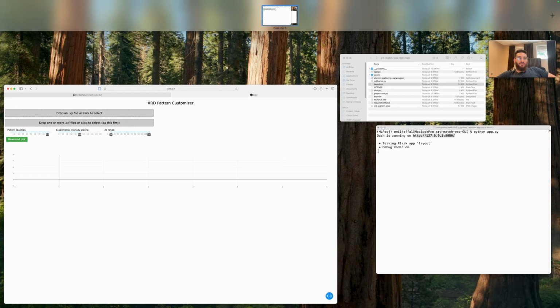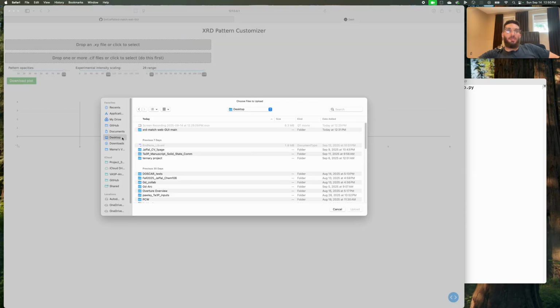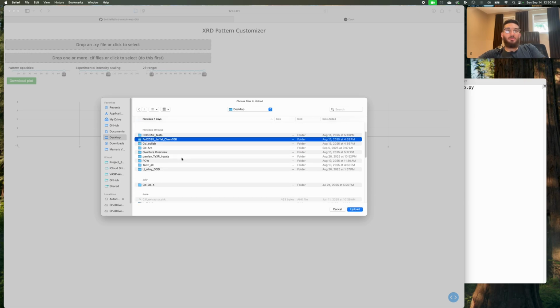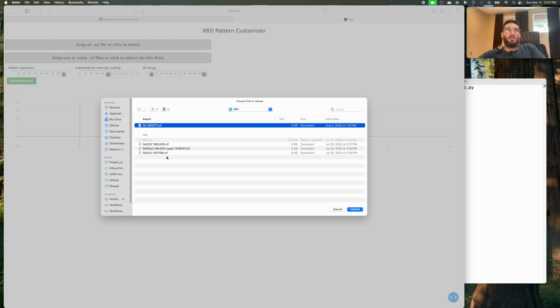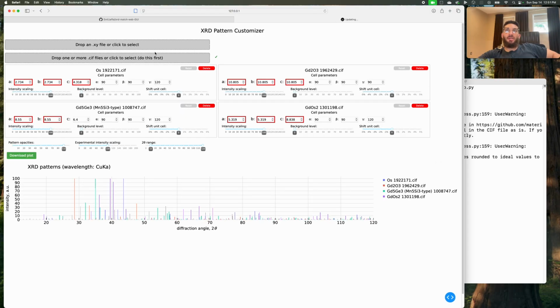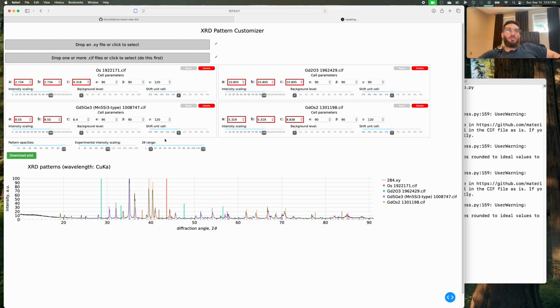So for this, all you do is you select the CIF files first, and I already have some experimental data that I like. So I'll go here, then I'll go to the folder. I'm looking for 284. And I'll just select all of these. There is one limitation, that you can only upload 6 at a time. But for the most part, it should be all right.